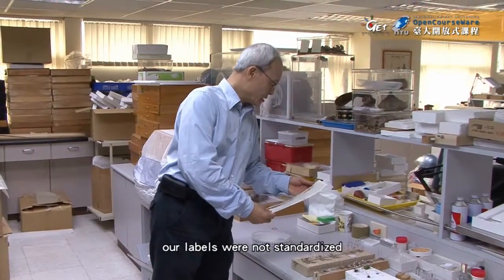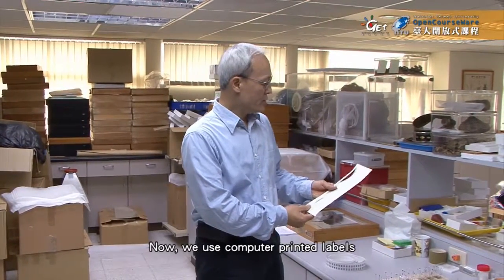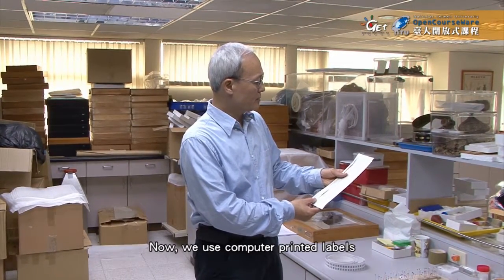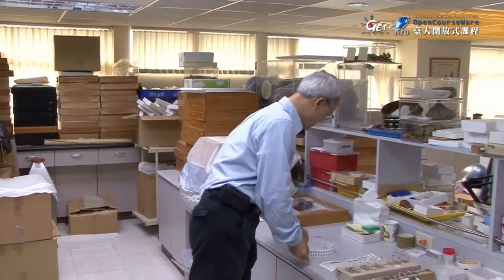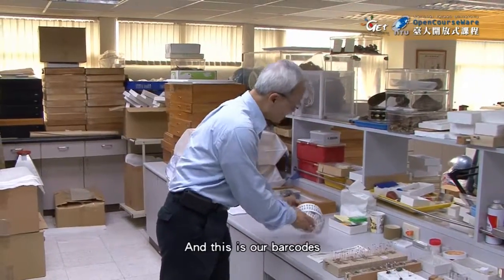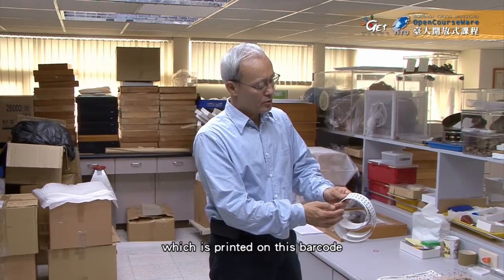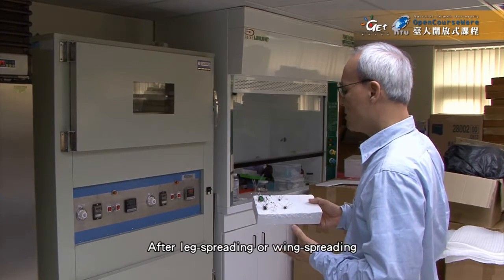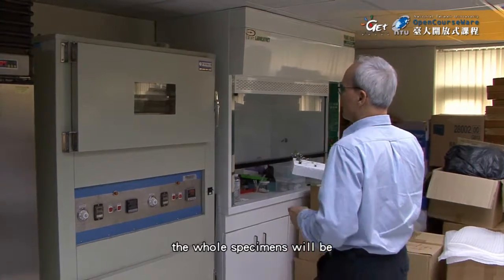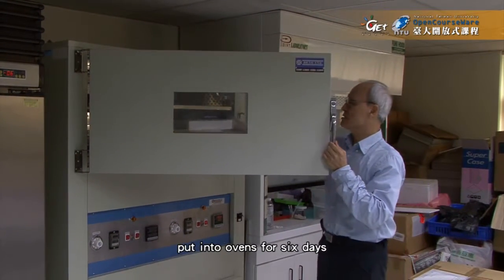In the past, our labels were not standardized and maybe handwritten. Now we use computer printed labels like this. And this is our barcode. For each specimen, we have a registered ID number, which is printed on this barcode. After leg spreading or wing spreading, the whole specimens will be put into oven for 6 days.